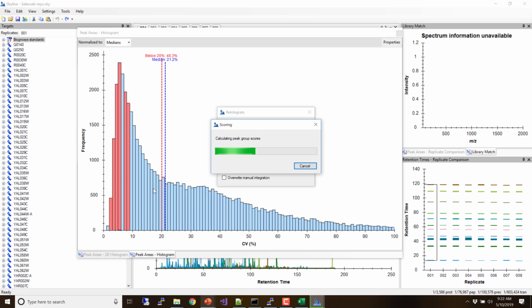But our goal here is we're going to do a comparison, and Mina's going to help us with the statistical part of it. We're going to compare just taking this document as it is, which is what happened in the Bruderer paper, or in the Selevsek paper, and running it against our osmotic shock data, versus using these 8 runs to pick only things that have low CVs.